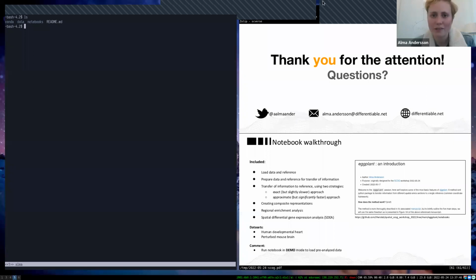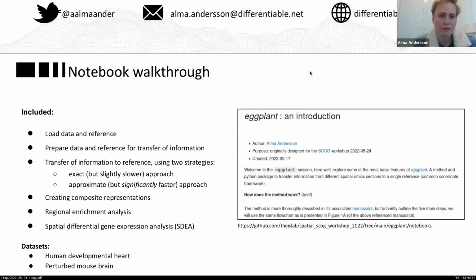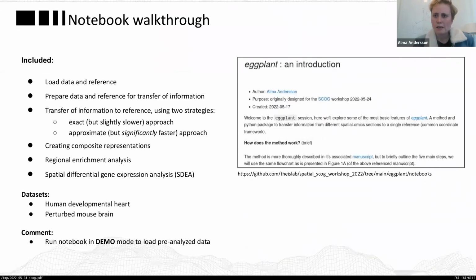Thanks. Yeah, awesome. And thanks for forwarding the questions to me. That's super nice. So let's see here. I think I have one more slide here just to say something about the notebook walkthrough.